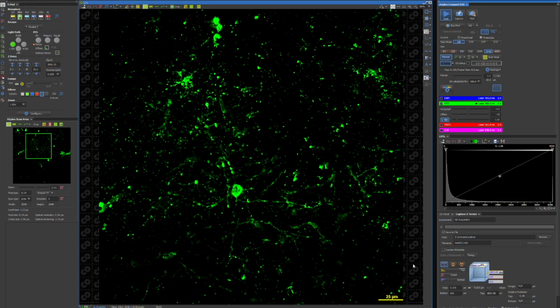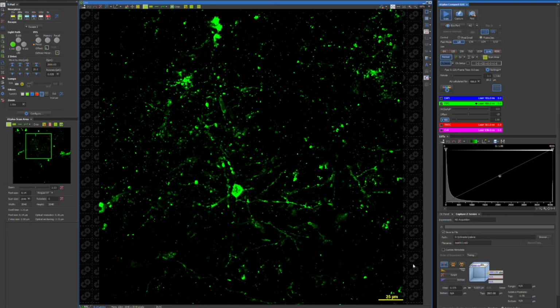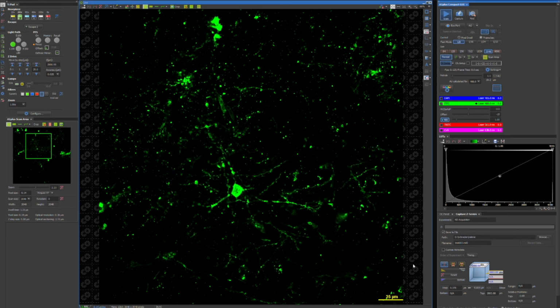It already looks super cool on the eyepiece, and I wish I could look at it longer, but consistent fluorescent light on a sample actually makes the dye fade, so I'm going to try to be quick in order to preserve the color. Yep, that's the neuron. I know it's sort of hard to see with all of the noise, but I want to direct your attention to the bright circle in the lower middle region of the screen.